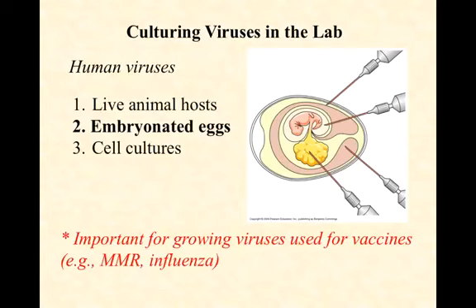And it's this process of removing the virus after they've grown and purifying away the virus from any other contaminants that leads us to need to watch out for folks who have egg allergies, because some of the egg protein will often come along with the virus, and even after purification, it may still be there. And if someone has a real strong sensitivity to those proteins, then injecting them with the attenuated virus is very likely going to cause an anaphylactic or at least some sort of reaction.